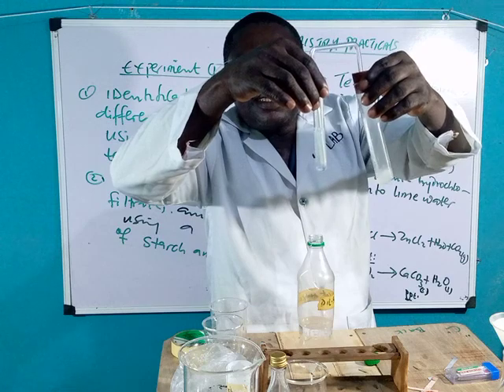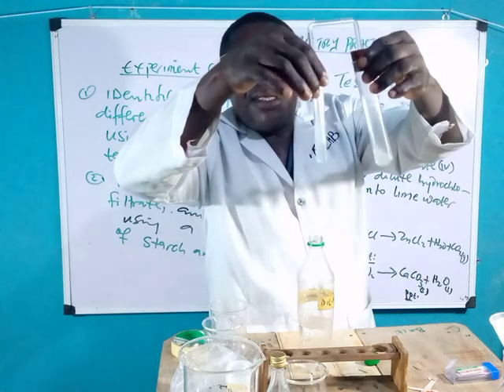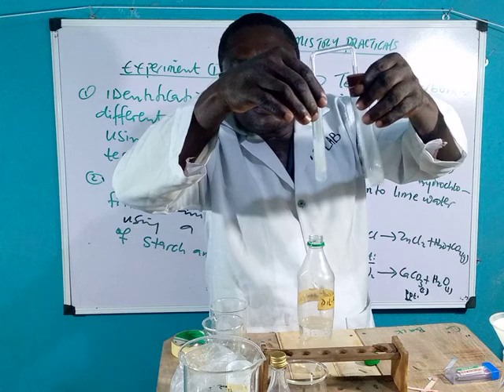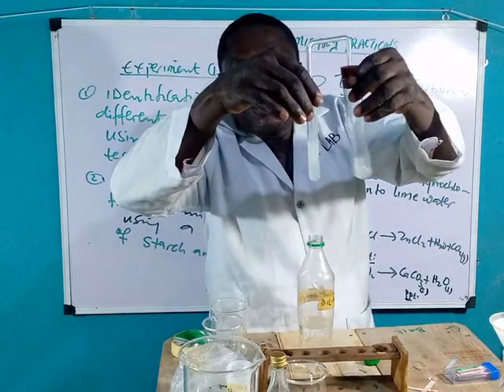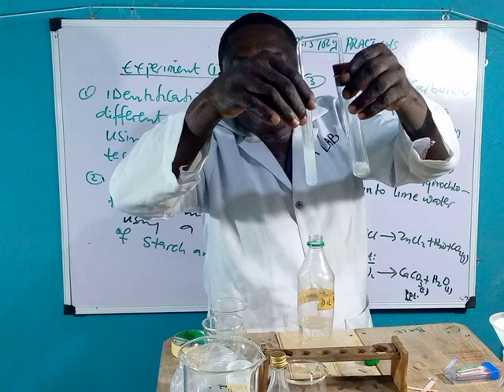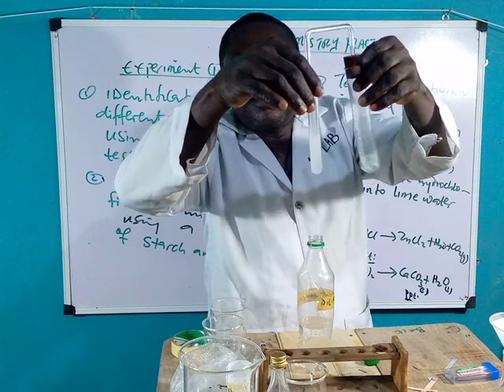That is lime water turning milky. You see it as we shake it. Carbon(IV) oxide, you see the color has changed. It gradually becomes thicker as more carbon(IV) oxide is being released into it. You can see it gradually become thicker and the bubbles continue. You see the color is gradually changing. Nobody will allow you to do this in your WAEC examination hall. It's believed that you have passed through this stage and you have known it. You can see it becoming thicker and thicker.